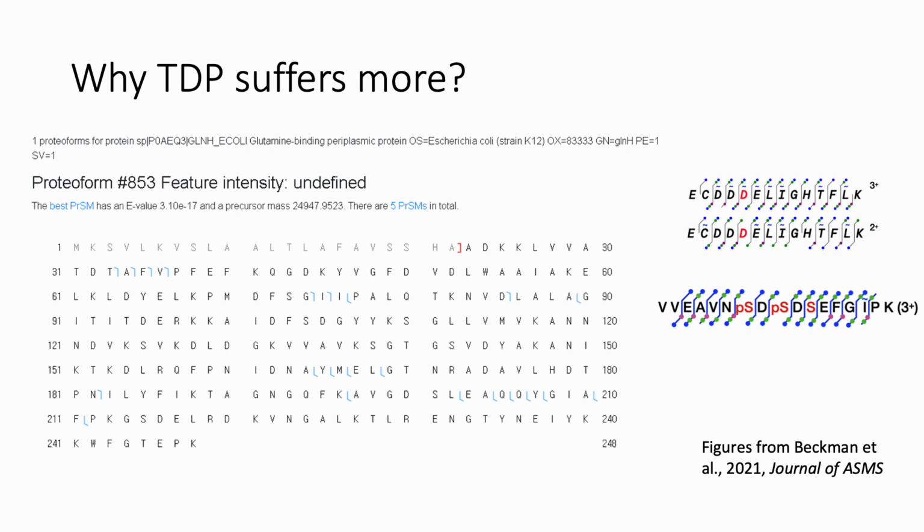In bottom-up, if precursor mass is incorrect, we lose for sure prefix or suffix ion matches. But at the same time, in most cases, these complementary ion pairs are also lost, bringing a huge drop in match scores. But in top-down, we will lose either prefix or suffix ions, but we do not lose many complementary ion pairs because there are not so many already.